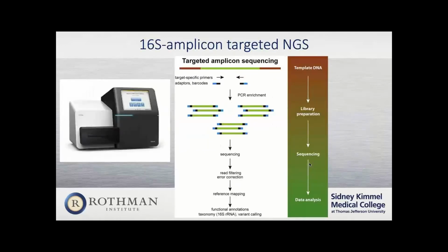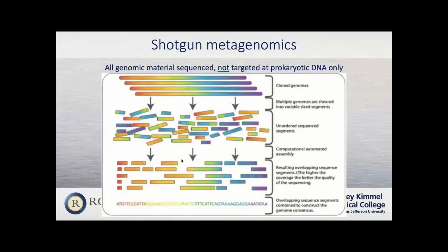So the 16S gene is then amplified by forward and reverse primers, and then it's pooled and loaded onto a sequencing platform such as the Illumina MiSeq, which is shown on the slide here. And this uses an image-based detection or fluorescent detection method, which is known as sequencing by synthesis. So a fluorescent change is detected every time a complementary tagged nucleotide is incorporated into the DNA. And then the reads generated are denoised, and then there is a comparison using bioinformatics of the sequenced reads against a curated library of over 50,000 different organisms to generate both species level and genus level distinction.